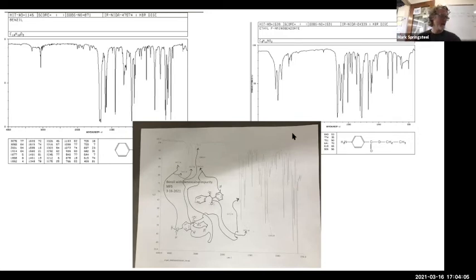So that demonstrates that we can separate them with extractions. I didn't do enough of the washes with 1 molar HCl and then 6 molar NaOH precipitations, because benzocaine's always a pain like that. You usually have to do a bunch of them, and I felt like I was going overtime, which I'm even going more overtime now.